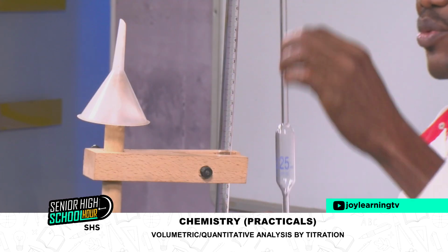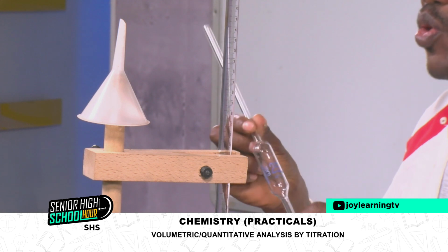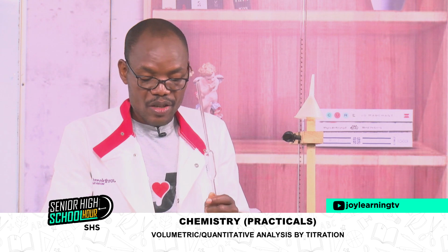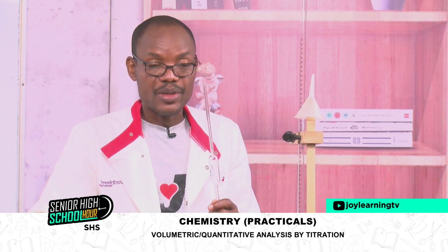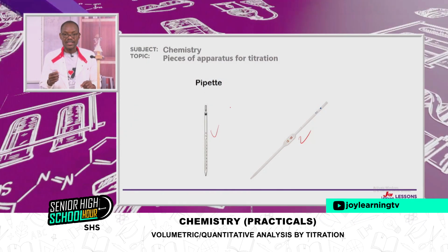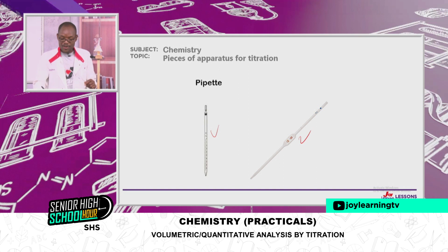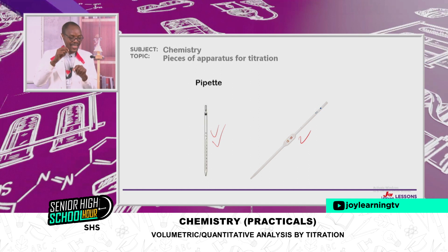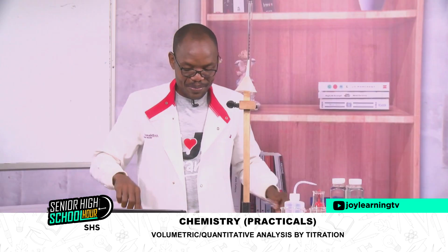We have the straight one. Whichever one you have in your school, please, you can use. We have, as you can see on the screen, the graduated one. That one is straight. If you have that one too, no problem. You will carry out a successful volumetric analysis.